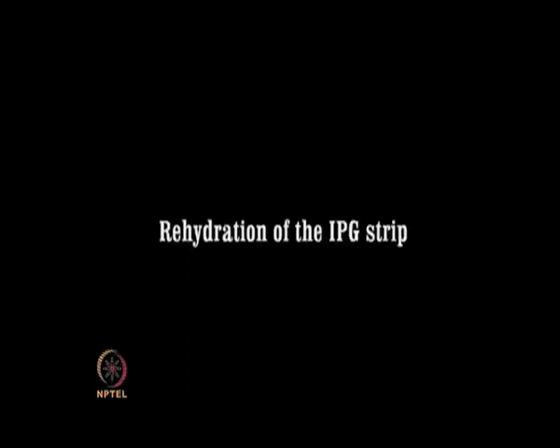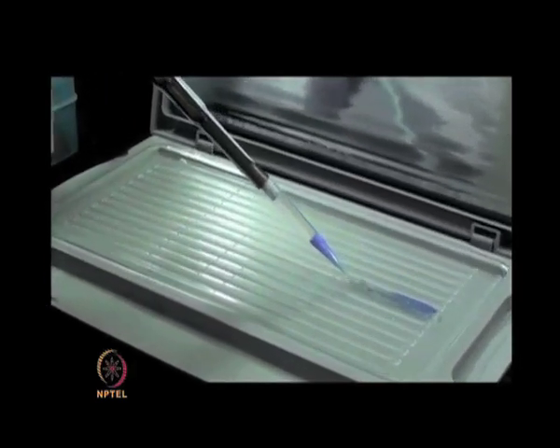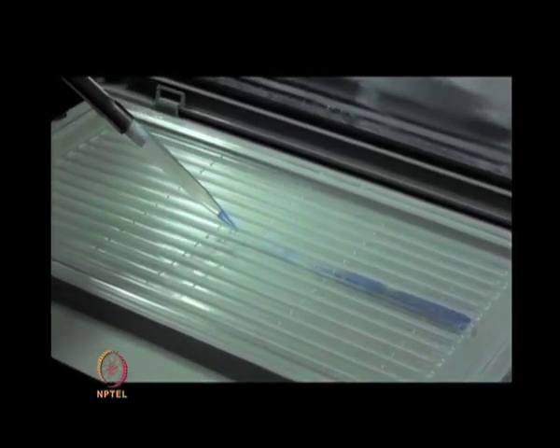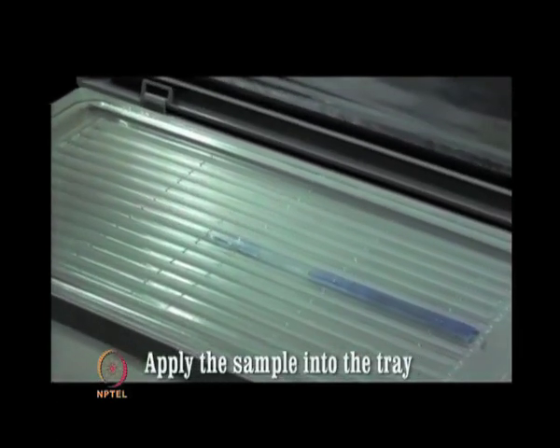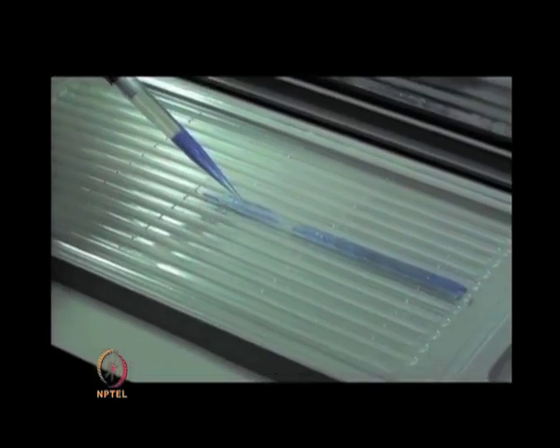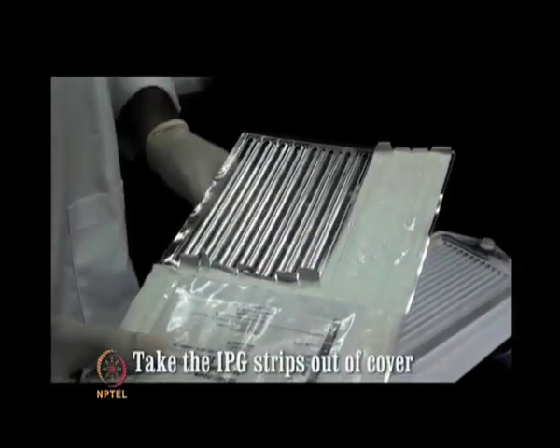IPG strip rehydration. Clean all the apparatus thoroughly before use to avoid any contamination. Add the reconstituted protein sample in a well of the rehydration tray. Then remove the IPG strip from its cover and place it carefully in the well.